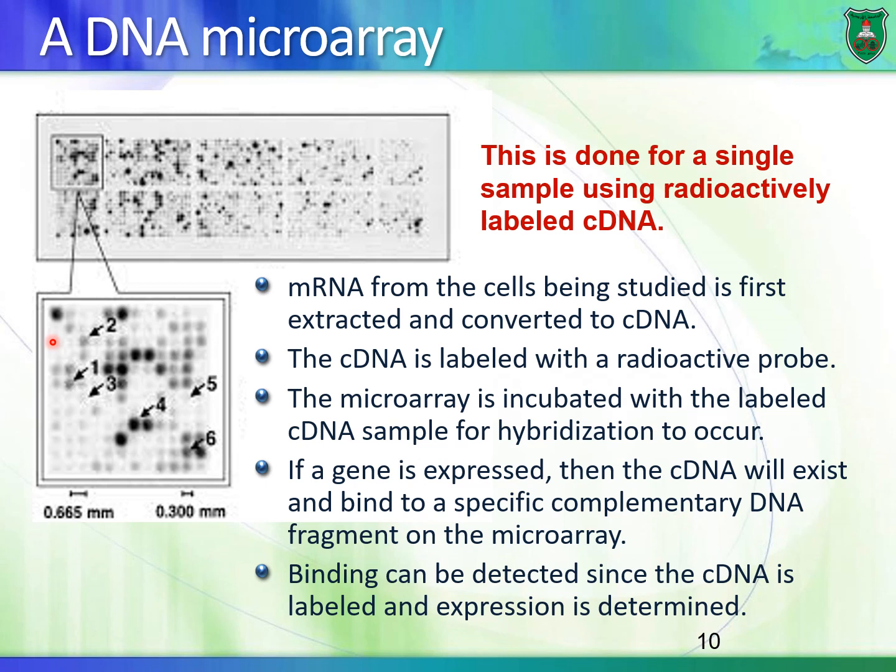Then we throw all of these cDNA molecules onto the microarray, and each cDNA would bind to its probe. So you will have on this spot 1,000 cDNA molecules bound. The one next to it, you have maybe 50, I don't know, 10, something. There is little signal right here. The one next to it, there is no signal. So what does that mean, that there is no signal? It indicates that there is no cDNA, which means that initially there is no messenger RNA, which means what? It means that the gene is not expressed.